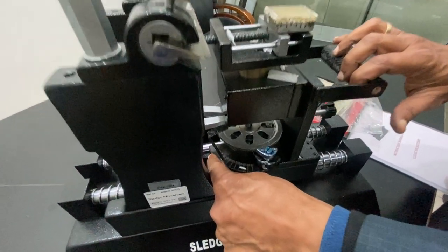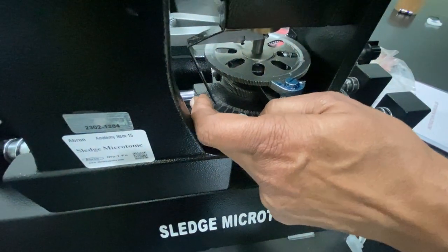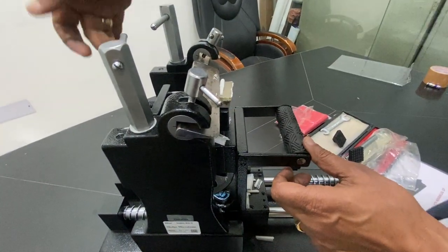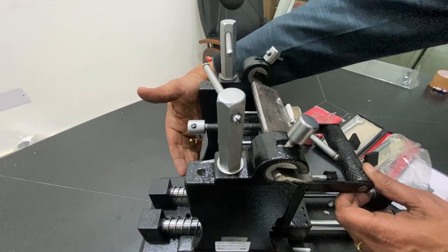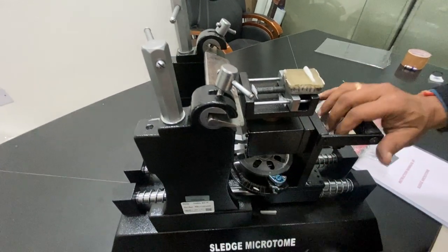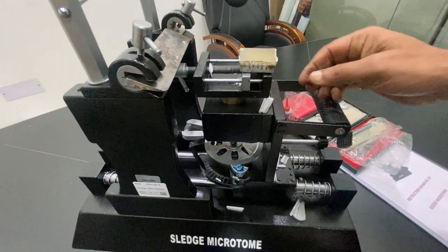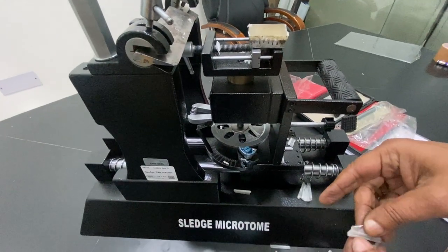Initially, this should be thicker so that it is easy to cut, this goes up. Then slowly you can put it on 5 micron or 10 microns. And then the block here should be coming to both sides equally. For that you have to adjust this screw so that the angle of the block is proper, and this below, so it is touching, and then the thickness is in microns. And it is very easy to cut like this. Samples are coming in this section. They will be in slices of the wax.